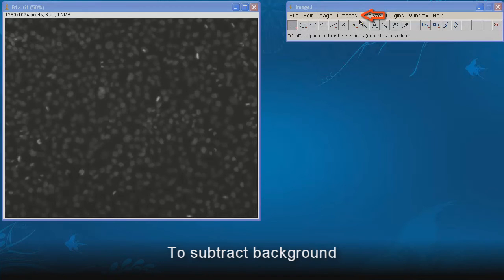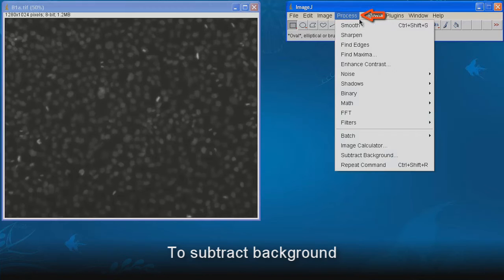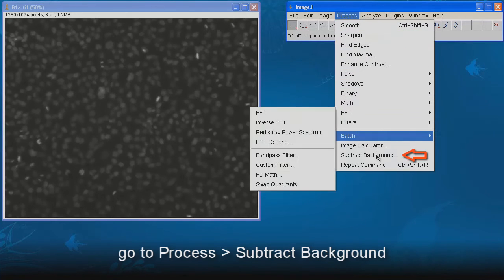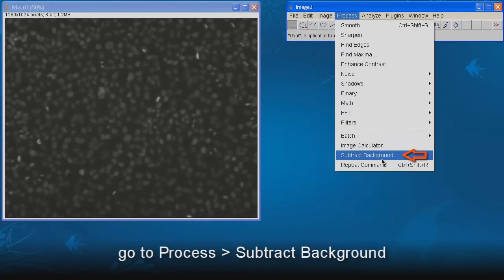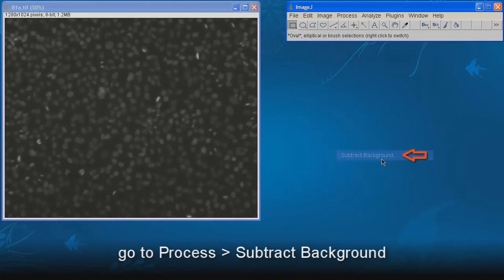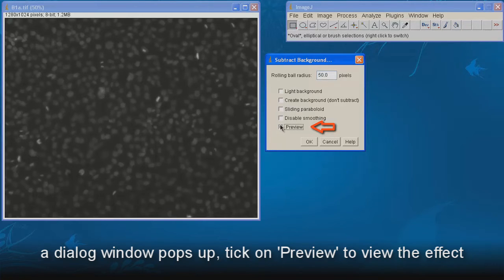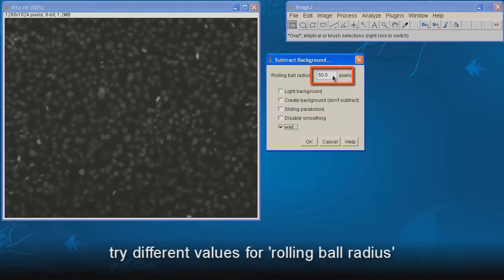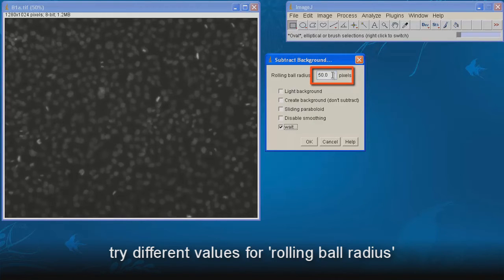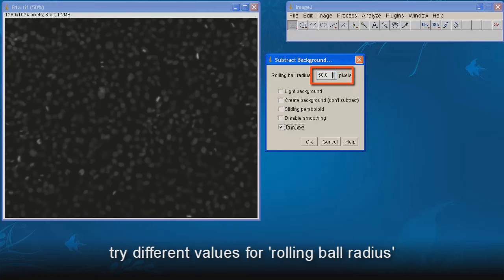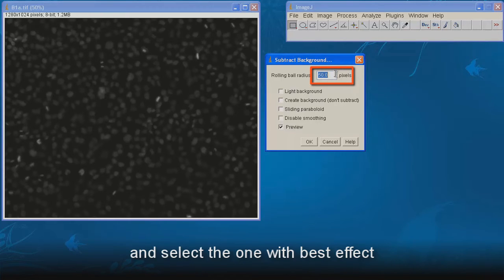To subtract background, go to Process, Subtract Background. A dialog window pops up. Tick on Preview to view the effect. Try different values for rolling ball radius and select the one with best effect.